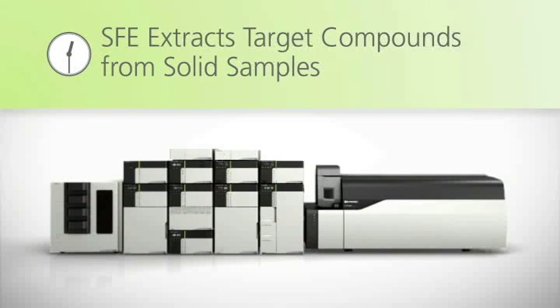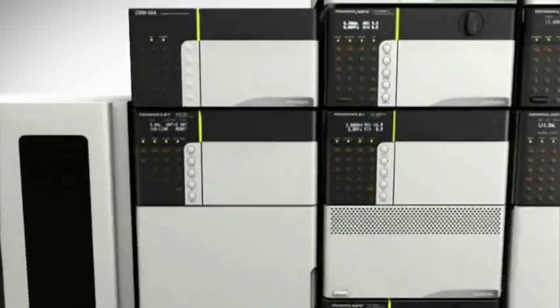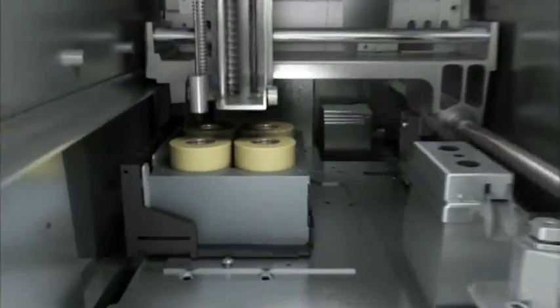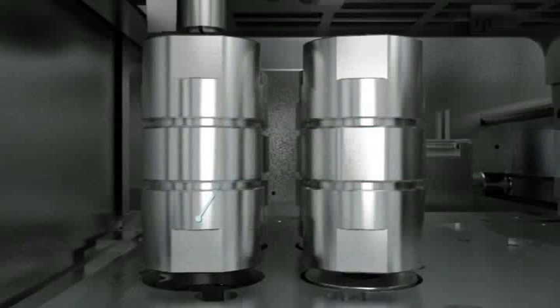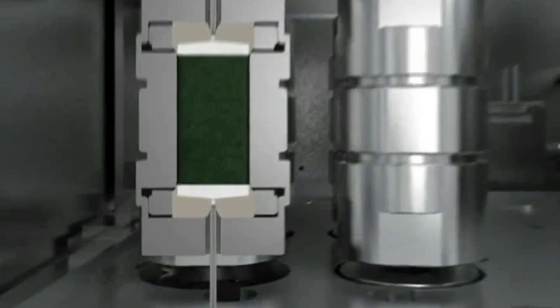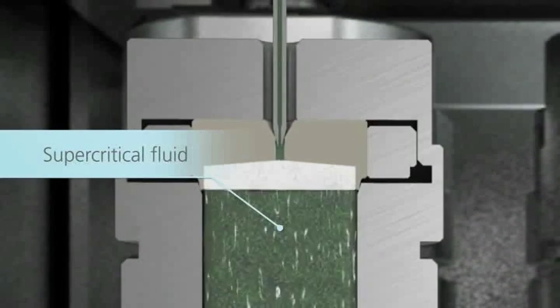The Nexera UC Online SFE-SFC-MS system is a groundbreaking analytical tool that combines supercritical fluid extraction and supercritical fluid chromatography. Reusable vessels are filled with solid sample that requires minimal preparation, and supercritical fluid is used to extract target compounds and transfer them to the analytical column.